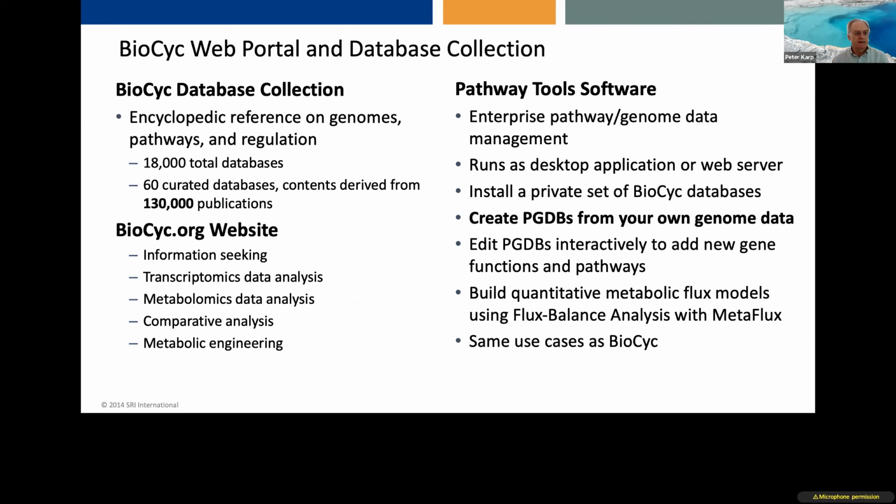So with that, let's get started with the introduction to BioCyc and Pathway Tools. So BioCyc is both a web portal and a database collection. So it's an encyclopedic reference on genomes, pathways, and regulations. That's where the "cyc" in BioCyc comes from, stands for encyclopedia.